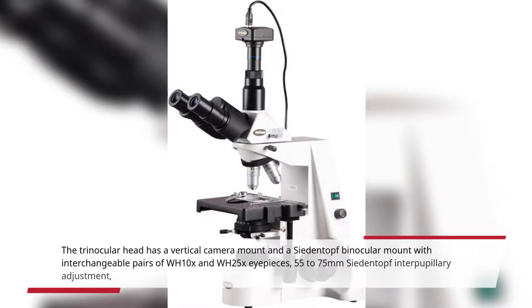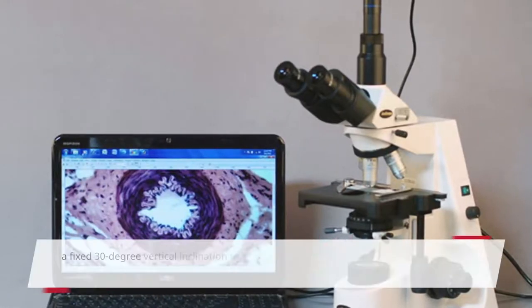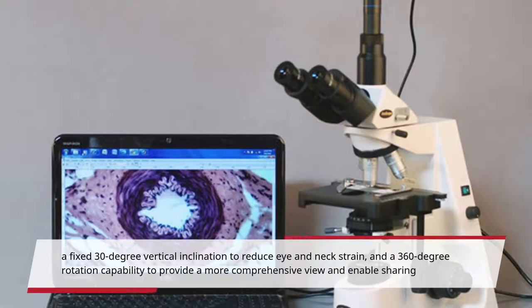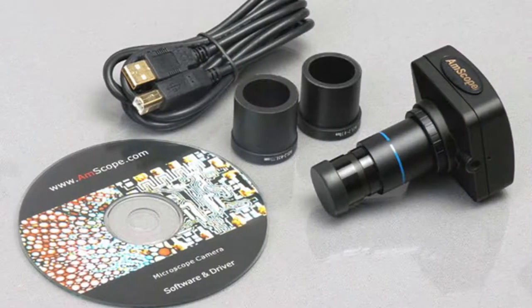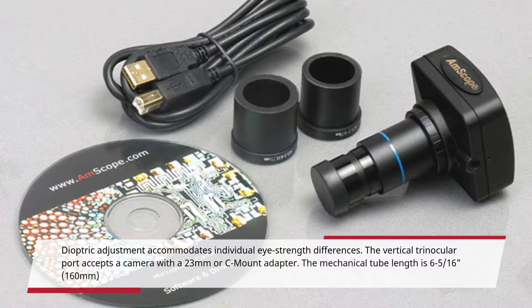The Trinocular Head has a vertical camera mount and a Siedentopf binocular mount with interchangeable pairs of WH-10X and WH-25X eyepieces, 55–75mm Siedentopf interpupillary adjustment, a fixed 30-degree vertical inclination to reduce eye and neck strain, and 360-degree rotation capability to provide a more comprehensive view and enable sharing.